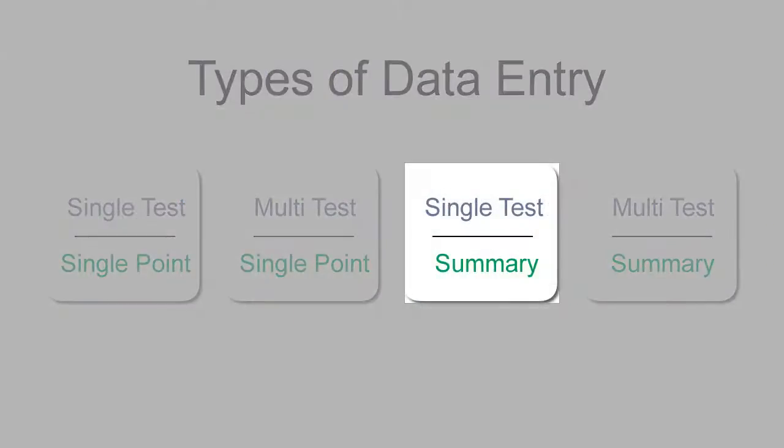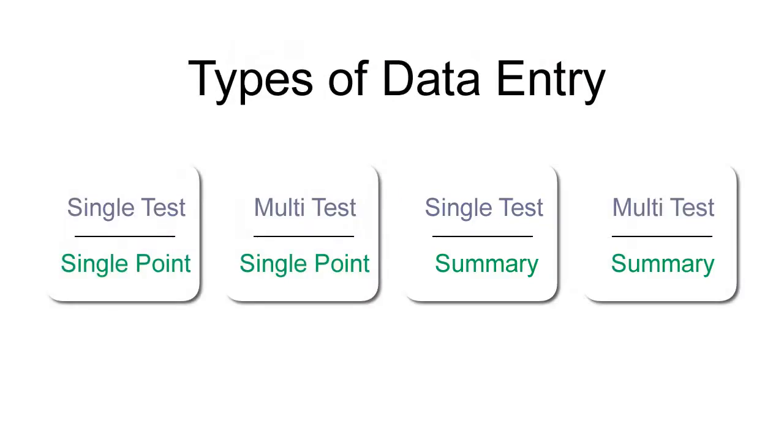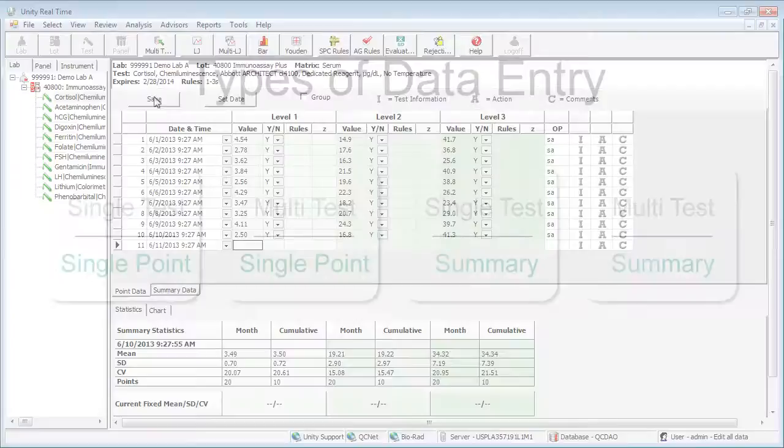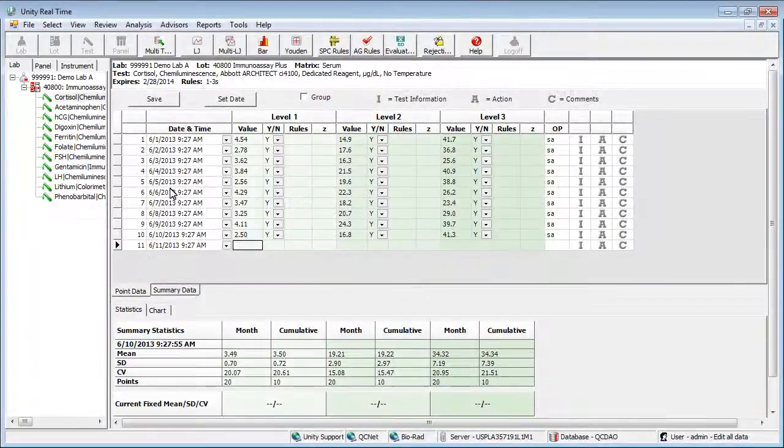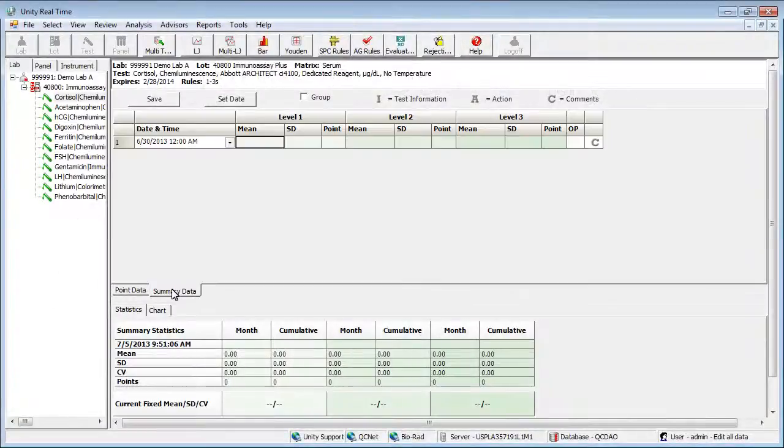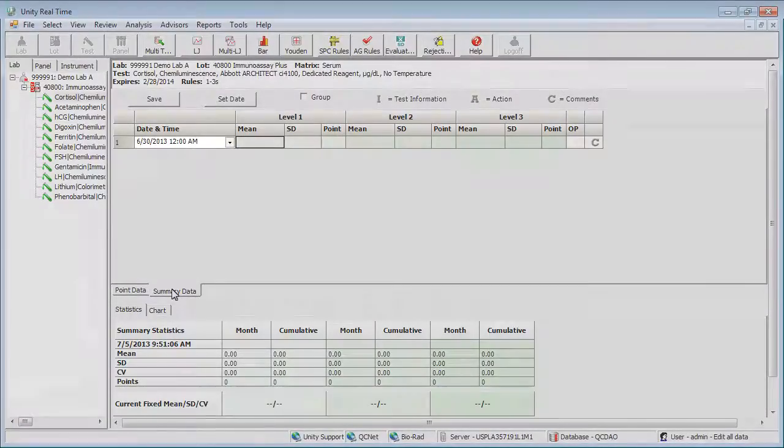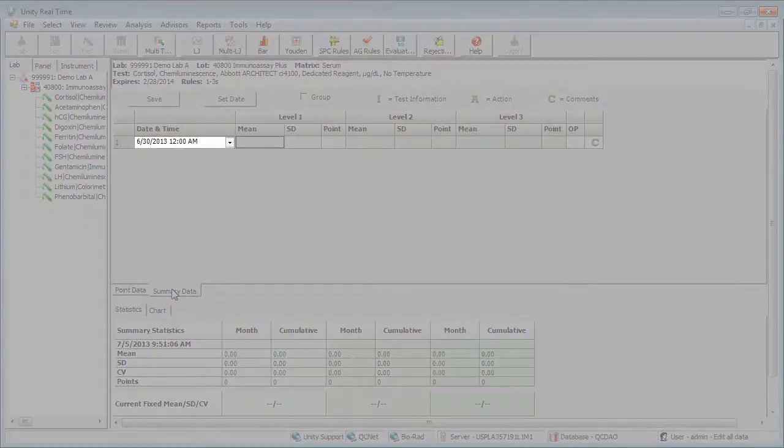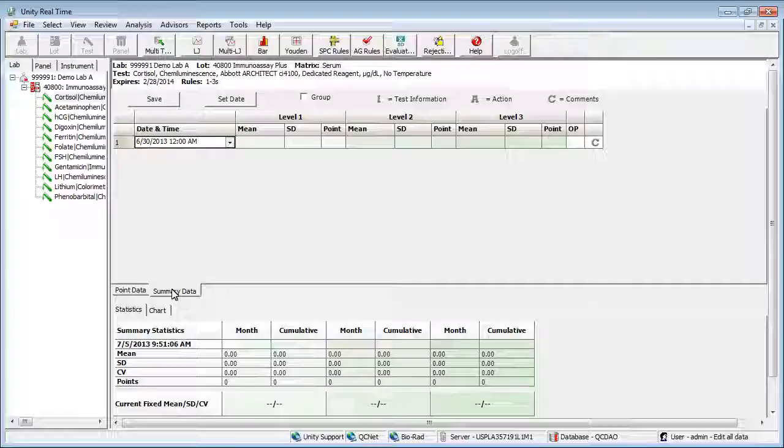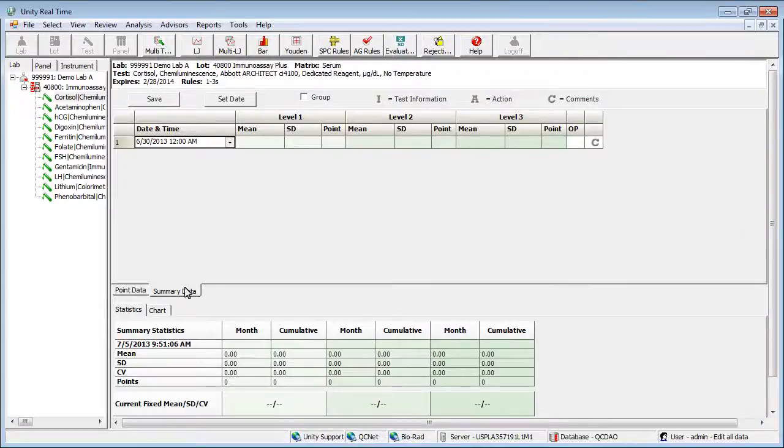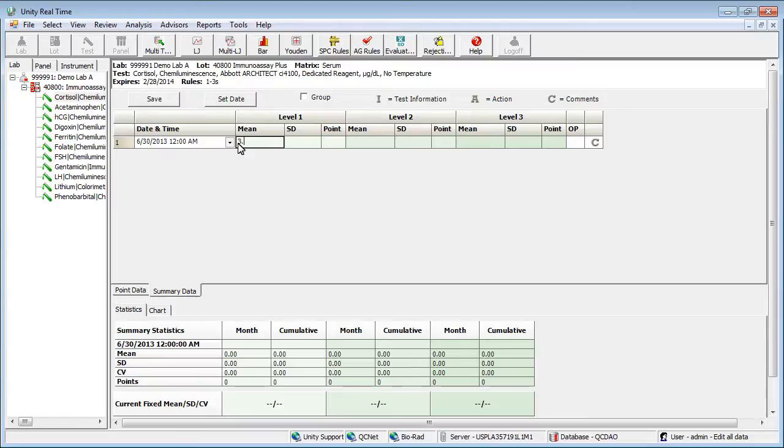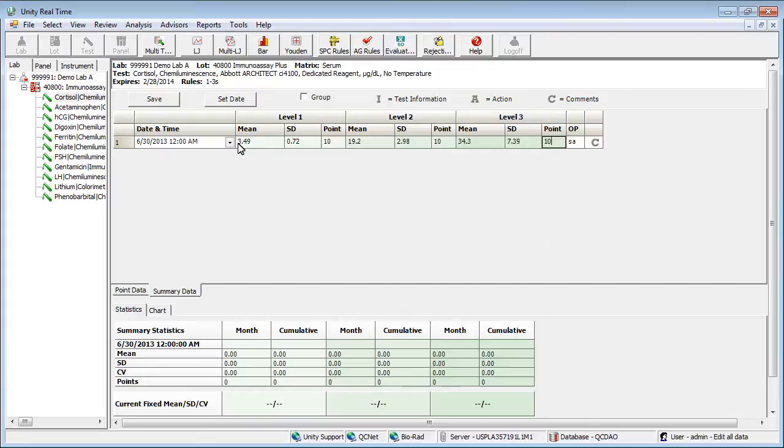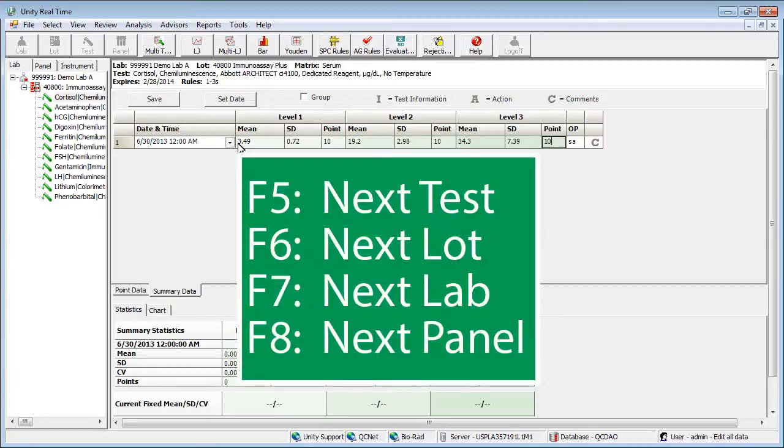Let's take a look at the next possible data entry method by returning to the screen where we left off. Select the summary data tab. Begin by selecting the date. Enter the mean, SD, and number of points. You can use the function key to move to the next item.